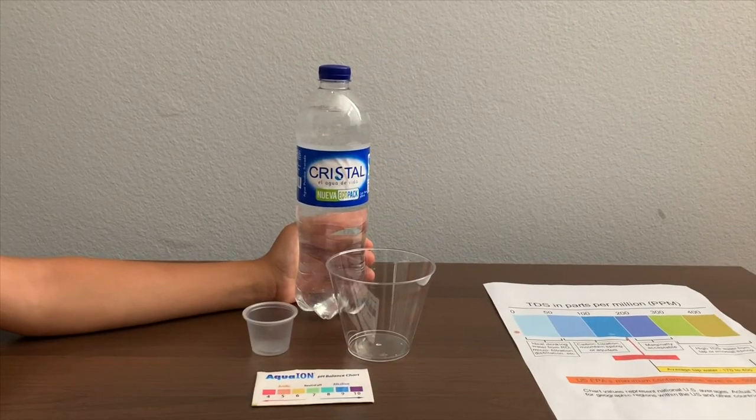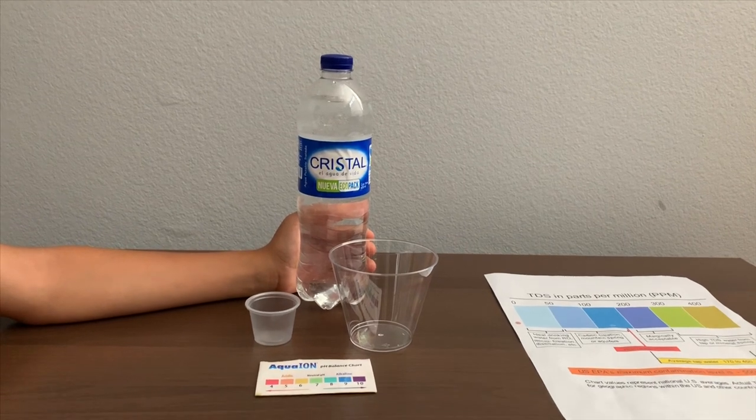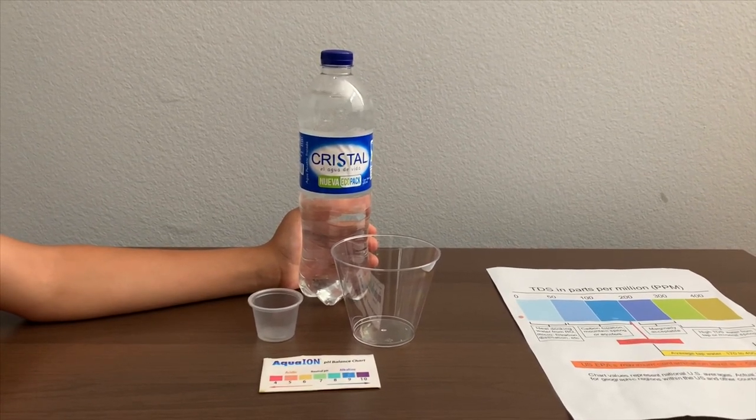This is Cristal el Agua de Vida spring water. We bought it from Colombia. Let's test the pH and TDS levels.